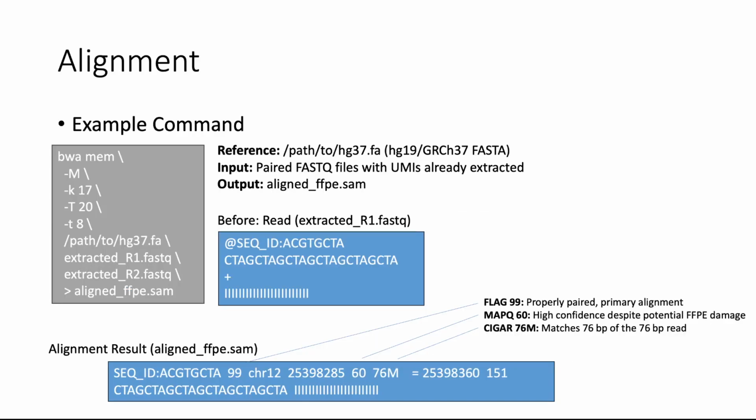So as a result, we will convert our FASTQ data, which is exactly a certain read with a sequence of nucleotides, to a SAM file, which is a human readable BAM file, and in here we'll have connection between our read and the genome position where this read aligns to, containing chromosome, its position, level of confidence, and how many base pairs are matching to this fragment.